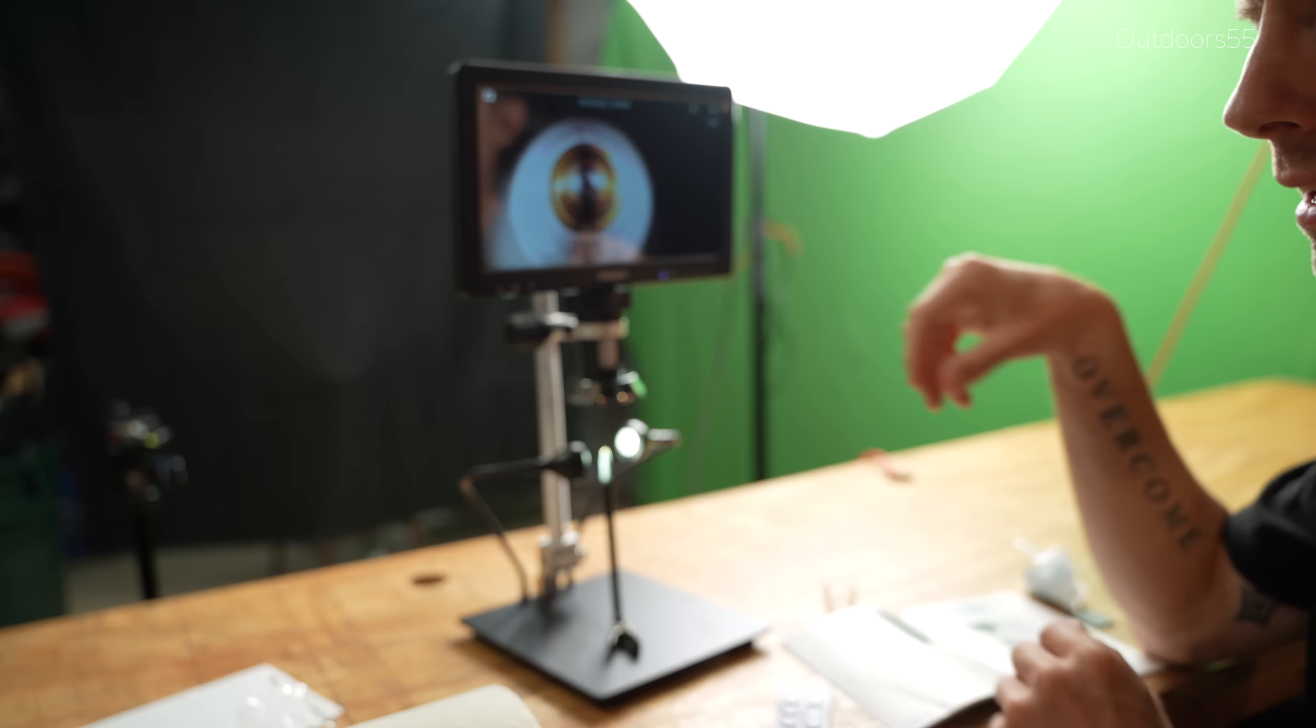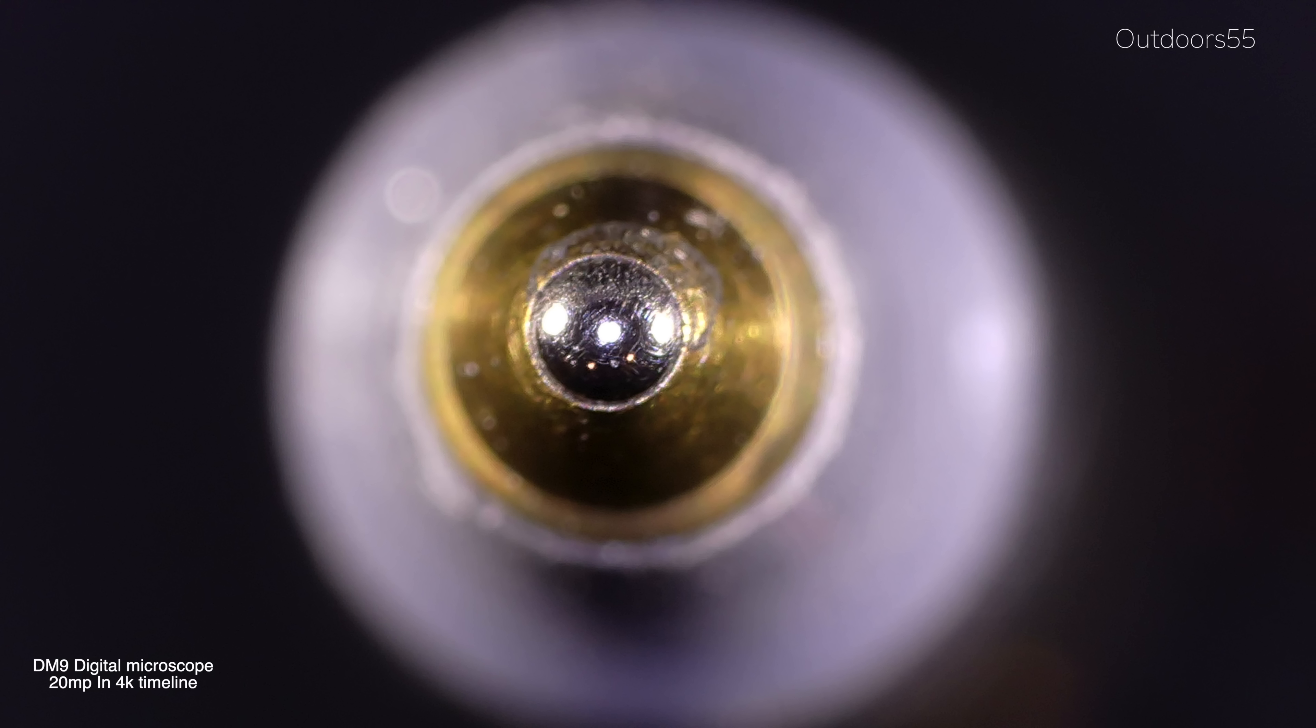So first off right out of the gate, this is a picture of our pen as close as this microscope will focus. And this is on the 20 megapixel camera setting. Basically, this is right out of the box what you're going to get, which is not great, but I will show you how to get better results in a second.